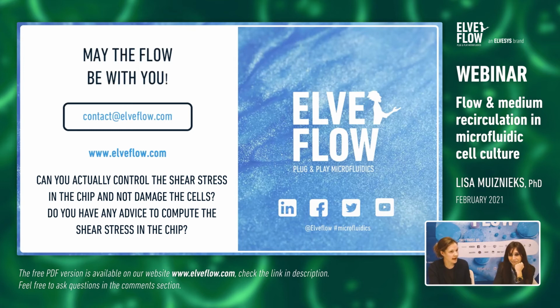Certainly. This is like adding recirculating cells, if you like. Here the key is you don't want the particles to clump together, so you want them dispersed. To trace the particle motion within the chip, I imagine that would depend on your chip. If you had the chip on the stage of a microscope and you could take a video, or if the particles were fluorescent, I imagine you could for sure think up a system to check that out.